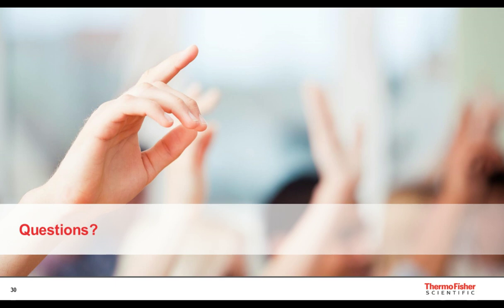Okay, thanks, Christy. I think maybe I can start with this one. A couple key things to keep in mind are really the types of questions that you're trying to answer with the 3D models. What we found, and I think highlighted throughout the webinar, was the increased activity that we find, but with lower numbers of cells.